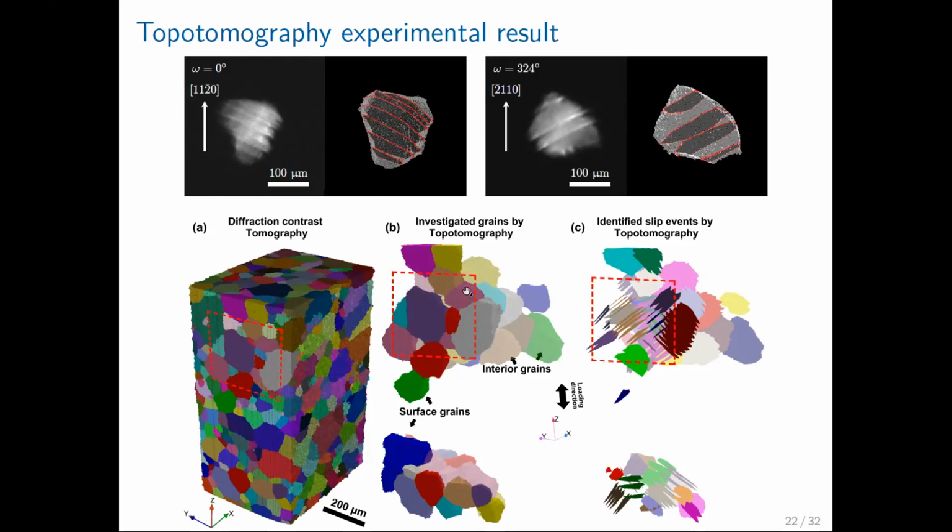So we pick grains. In the previous study, we did this already, but we studied only 3 grains, and it was kind of difficult to conclude on what the transmission mechanisms are, how plasticity proceeds. So here we automated the method. You program the diffractometer to scan all the grains given their orientation. We mapped 55 grains in 2 different neighborhoods, because with the DCT, we can pick grains and their neighbors.